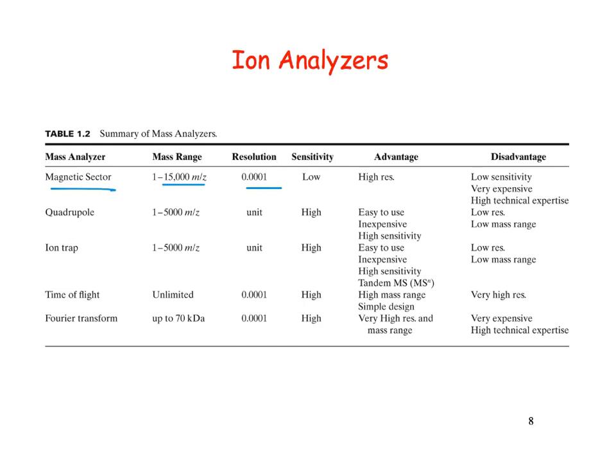We need to be able to go to something like 0.0001 to do high resolution mass spectrometry. So the advantage is high resolution. Disadvantages are that it has a low sensitivity as far as mass spectrometry goes. But I think mass spectrometry is more sensitive than a lot of other techniques that we use. Expensive, and you need to know a lot to run these things.